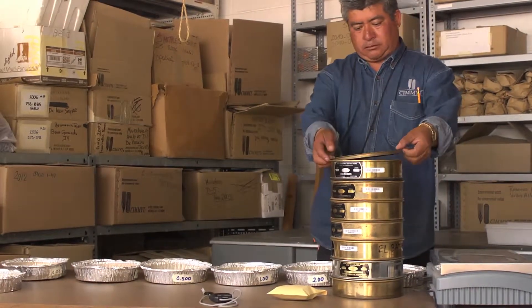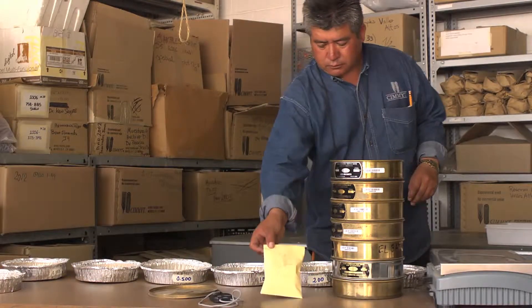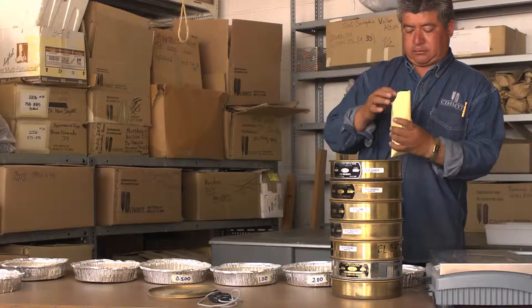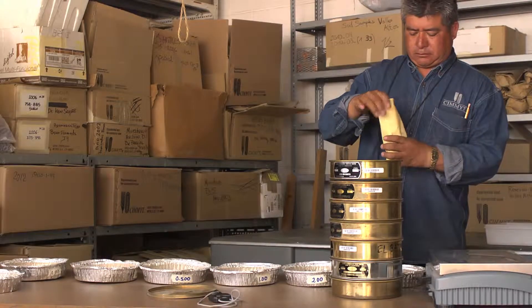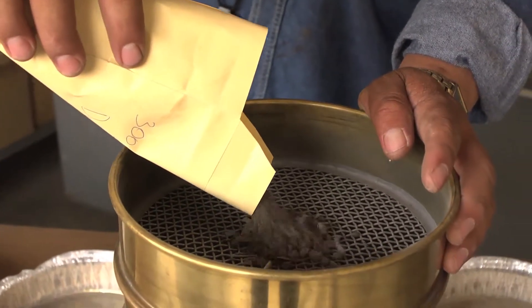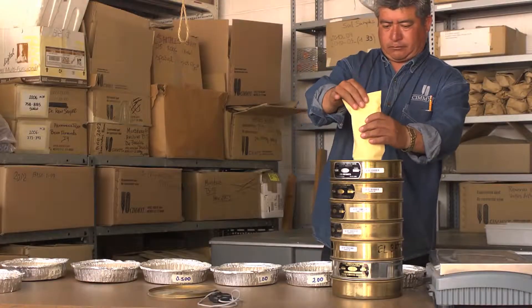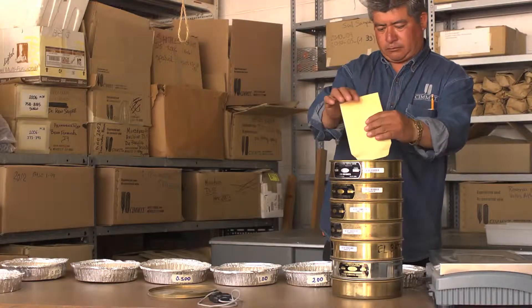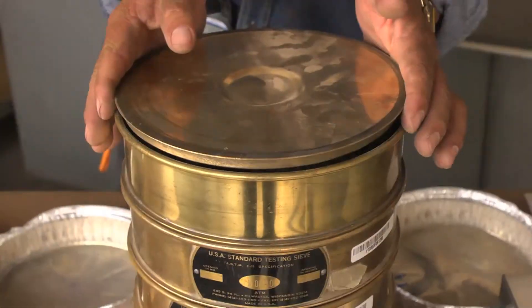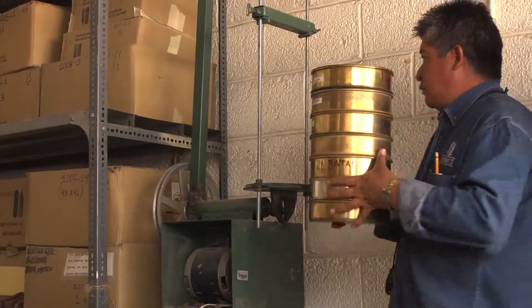Place the sieves in a stack starting with the largest mesh size on top and a closed pan below. Pour the samples onto the top sieve. Close the lid tightly and shake the sieves at a speed of 210 cycles per minute for five minutes.